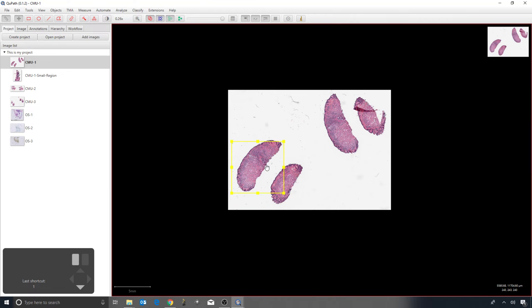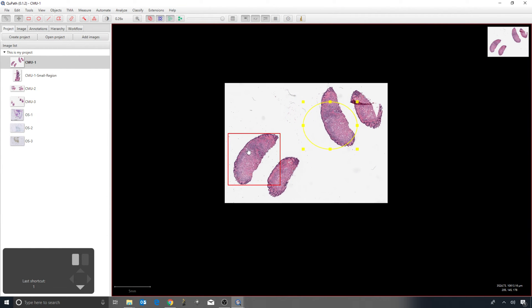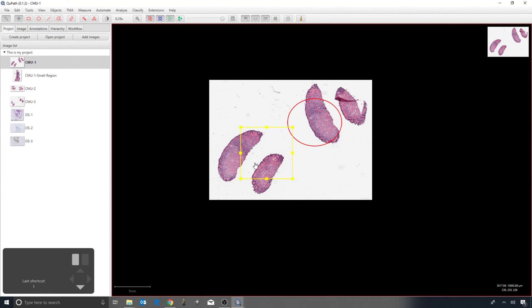Moving on to the ellipse tool — same idea: click and drag to draw. The ellipse turns yellow to show it's selected, while the rectangle turns red to show it's not. Using the move tool, I can move the ellipse, but clicking inside the rectangle won't move it because it's not the selected object. To switch selection, I can just double-click inside the shape I want to select.